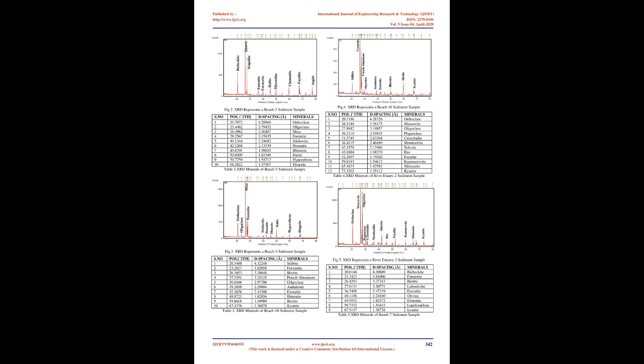3. Materials and methods. The selected representative 7 beach sediment samples from the study area were subjected to X-ray diffraction analysis through the XRD instrument X'Pert Pro installed in the laboratory of the Department of Physics, Alagappa University, Karaikudi. The powdered beach sediment samples were directly analyzed for general mineralogical studies by setting 2 theta position values from 0 to 80° in the XRD instrument. The XRD patterns, or X-ray diffraction of the minerals, were identified through respective D-spacing values and their intensity, and also from other published literature.